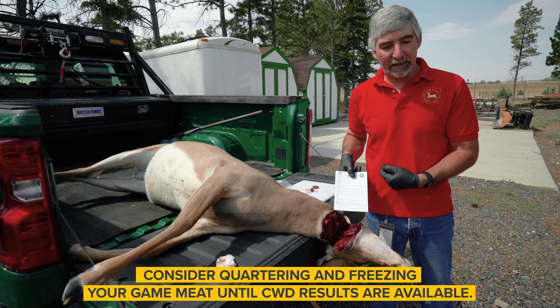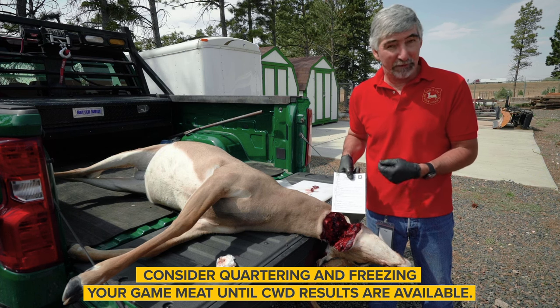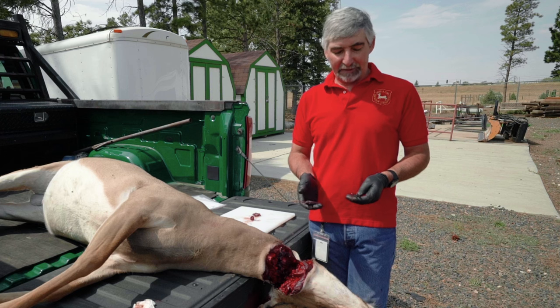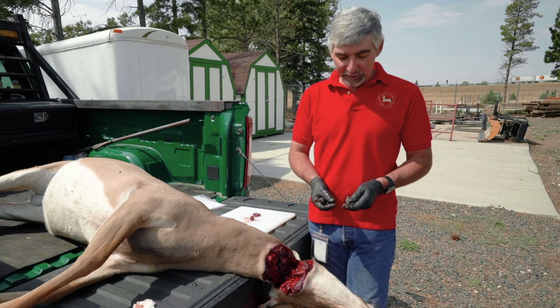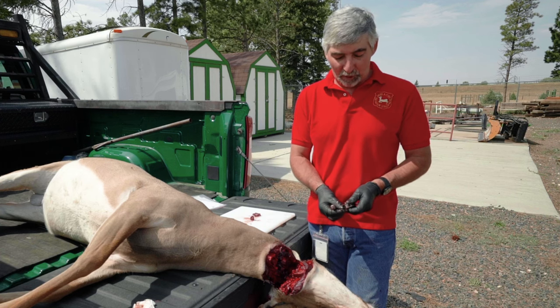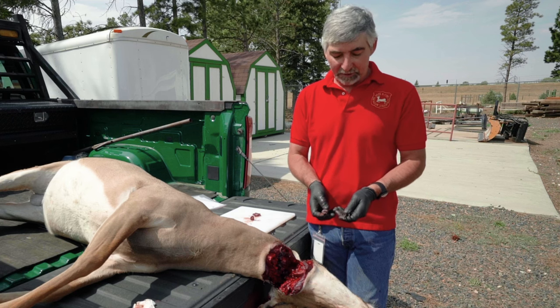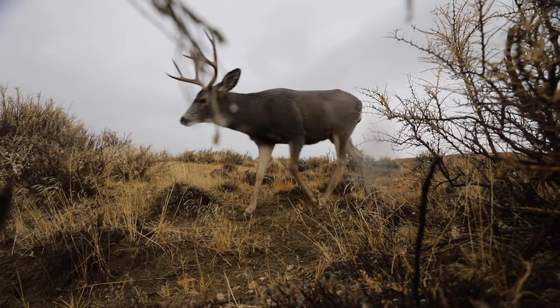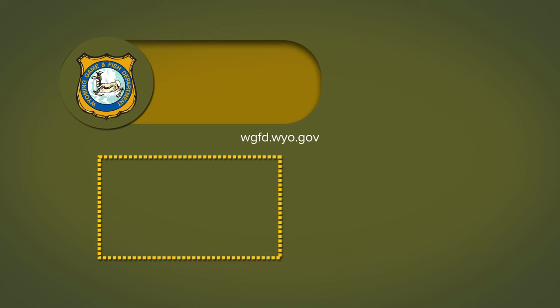We really appreciate hunters taking the time to collect a sample from their animal or dropping their animal off at a Game and Fish office to be sampled. Once you've collected your sample, CWD can be neutralized by soaking your instruments in 40% bleach for at least five minutes. It's really important that you take the time to clean them with soap and water first, get all the blood and gunk off, and then soak them in bleach for at least five minutes. We as a department really want to keep an eye on this disease, and we really thank you for your help — we couldn't do it without hunters' cooperation by submitting lymph nodes.